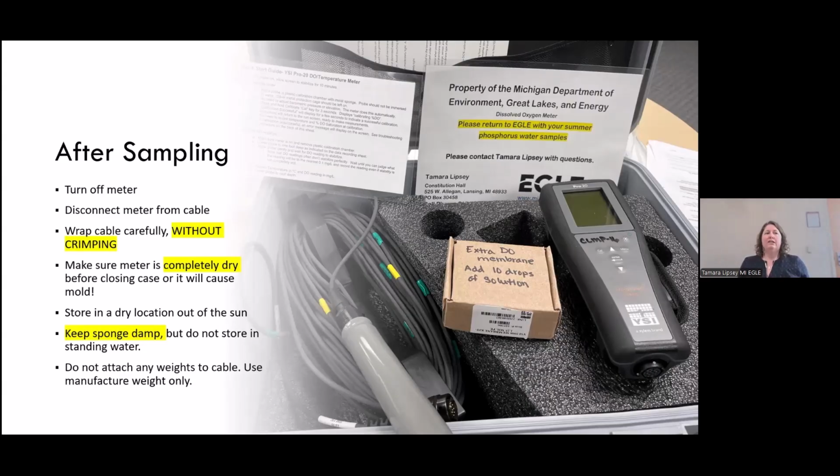And last on this list, do not attach any other weights except for that screw-on weight that we now supply. In the past, people would put different types of lead shot weights on the cables. Again, that crimps the cables, and so we don't use that practice any longer.